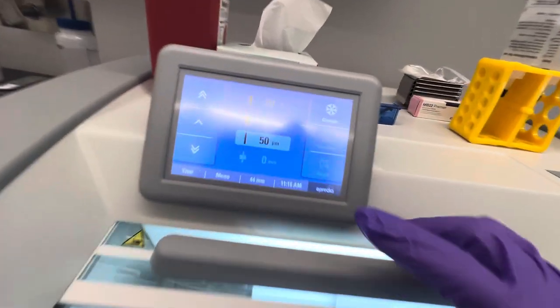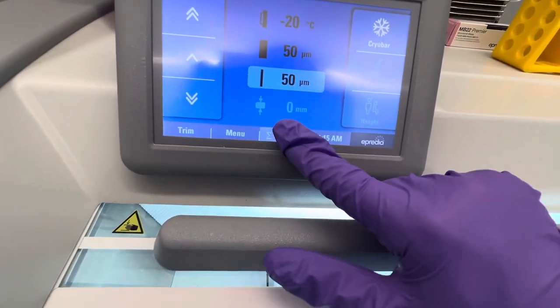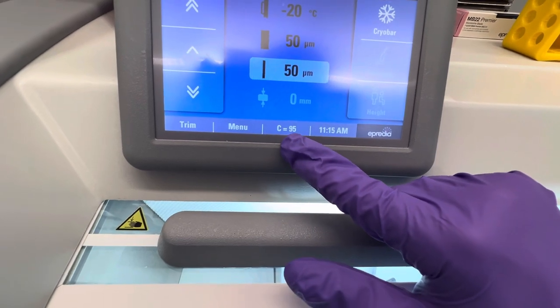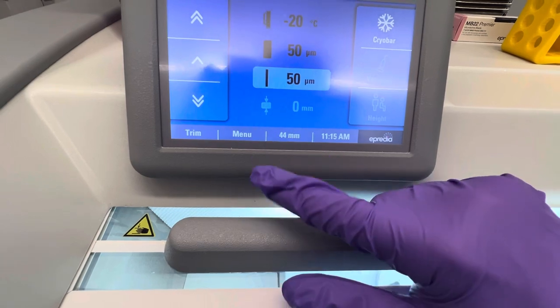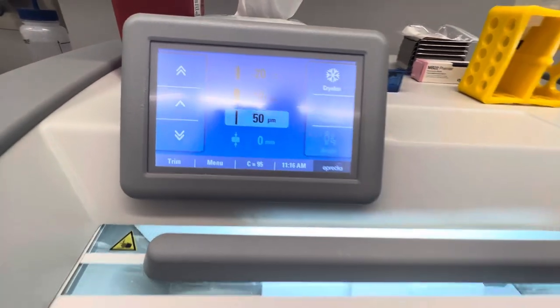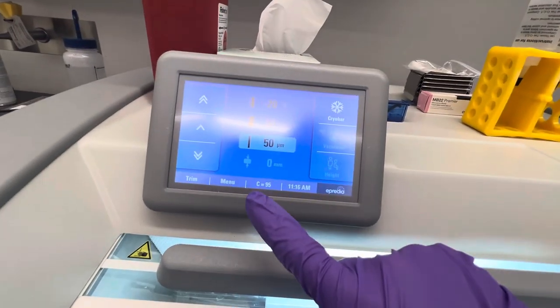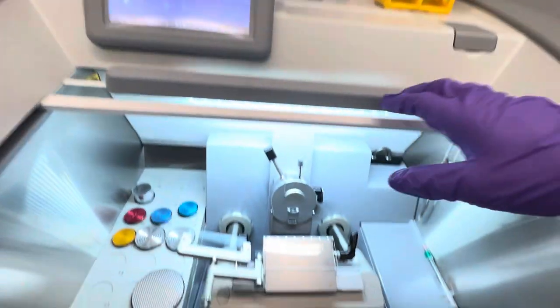I'm trying to think of anything else I would have missed, but that's the basics for actually using the cryostat. Again, you have your control panel. There are other features on here, like measurements, but you can have it set to where C equals 95. That's actually the number of sections if you hold this in. Oh, actually, I'm going to keep it there just in case somebody's working on this. But if you were to hold it in, it would be set to zero, and it'll count the number of sections you're taking as you do it. But that's just for this particular model. Again, it might be different for yours, but the basics should be the same.